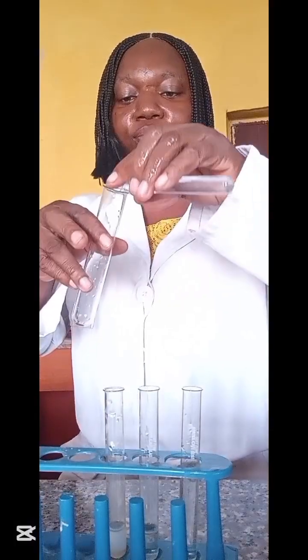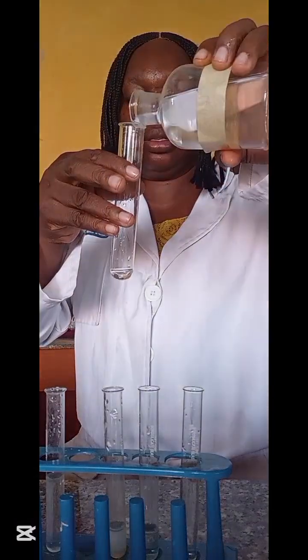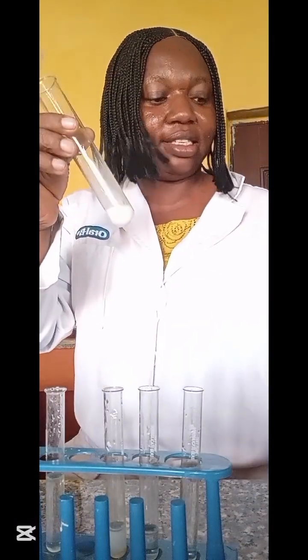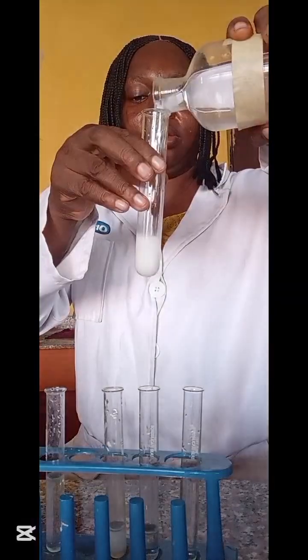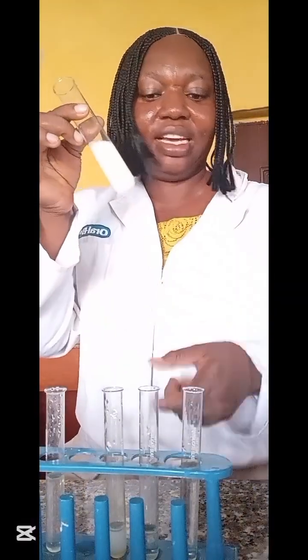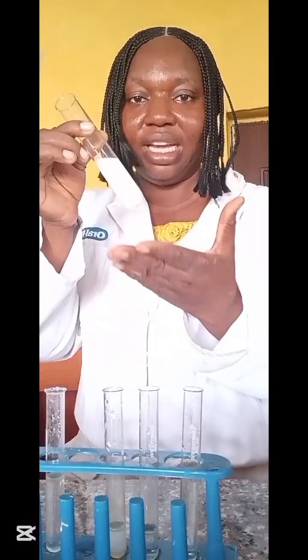Now the last one of the white. This is calcium. Calcium in sodium hydroxide gives a white chalky precipitate just like that. In excess, can you see? It does not dissolve. That is a typical property of calcium. A white chalky precipitate is observed. The precipitate is insoluble in excess.